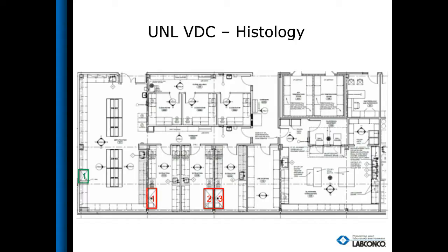They selected and they knew those were going to be installed in an exhausted mode on the front end, so those were automatically selected as Type Cs to get that chemical protection. They also knew that if at any time those cabinets needed to be converted into a recirculating mode, they could stub off that duct and the exhaust system and save some energy on the back end as well.